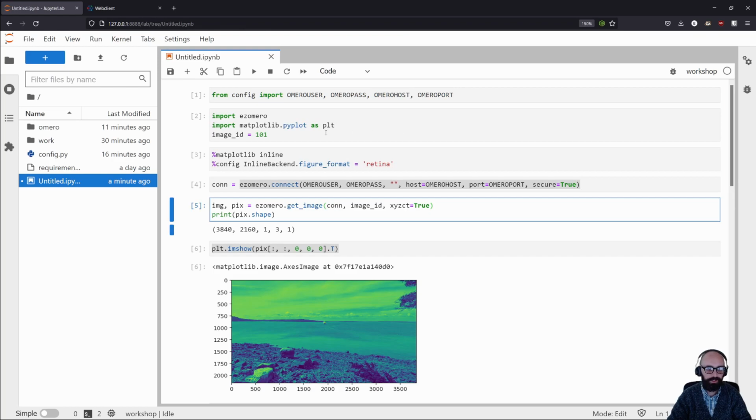So yeah, next step is we are going to be looking at how OMERO creates things in a server. If you want to take a break, this is a good time for it before we start a new part of this.